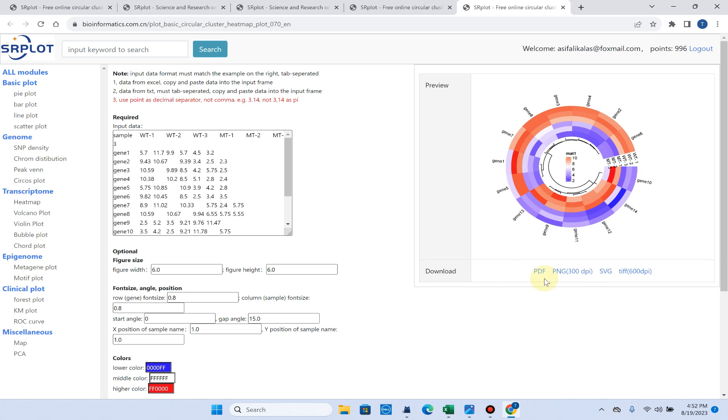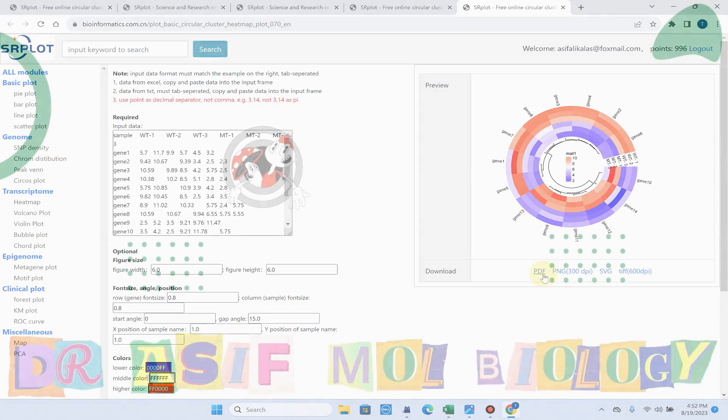The circular heat map is ready and we can download it in PDF, PNG, or SVG format for free.